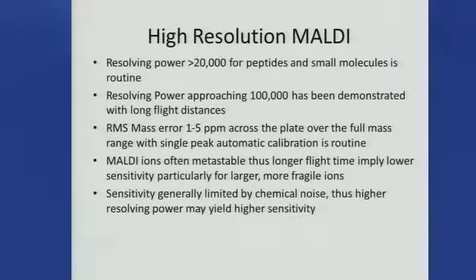So the status of high resolution MALDI now is, as I say, it's quite common and commercially available. The resolving power of 20,000 or more is available. You can go up to 100,000, but I'm not sure it's actually practical, although perhaps it is. Perhaps with a JEOL instrument, you might say.